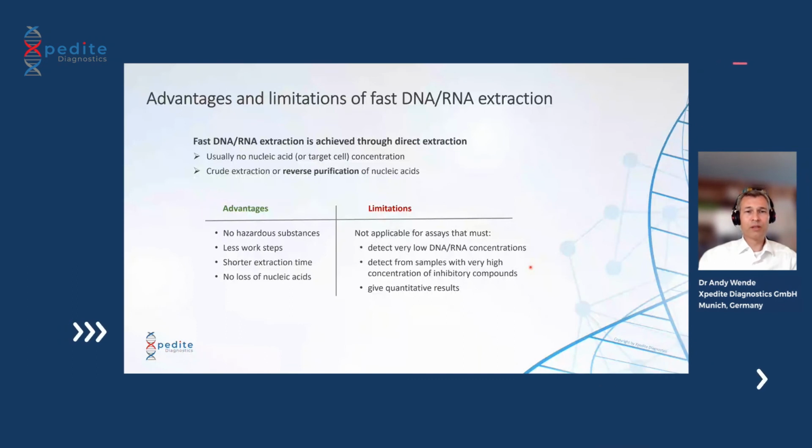Another limitation is that these fast extractions, because they do not provide a very pure nucleic acid, also give certain variations which matter if you have a quantitative assay. If you, for example, want to quantify, I don't know, hepatitis B virus, and you would do a fast extraction, then you would have certain variations which might be larger than with a proper DNA purification method.